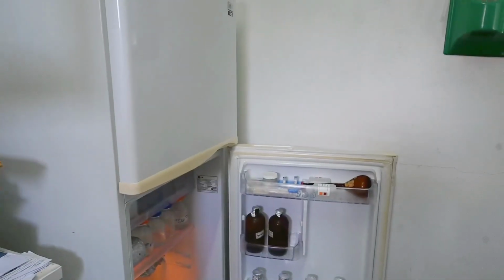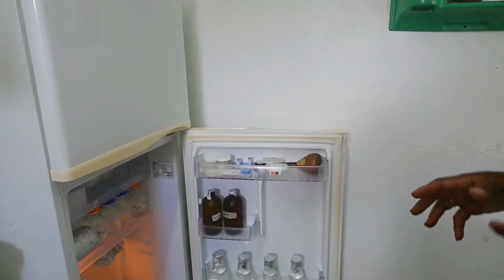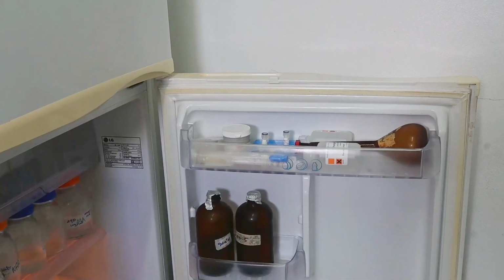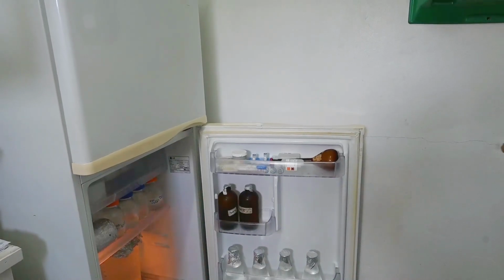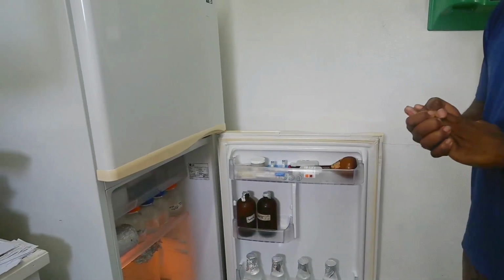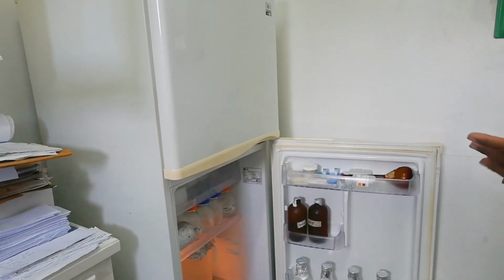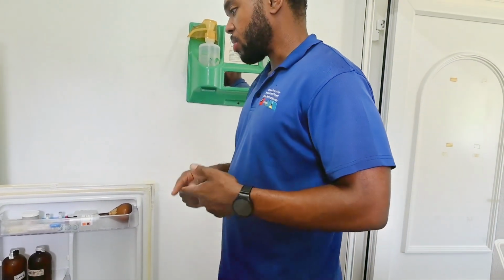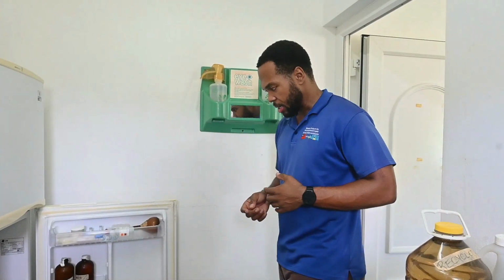Some of them are light sensitive, like this one. The iron stock solution is light sensitive, so it has to be in an amber bottle to restrict the penetration of light through it, or it will degrade it. Other than that, we add different things to the media. We can add organic substances like banana or potato, coconut water. It depends on the type of plant, and the nutritional requirements for that plant and the stage of growth and development that we're looking to put those plants under.